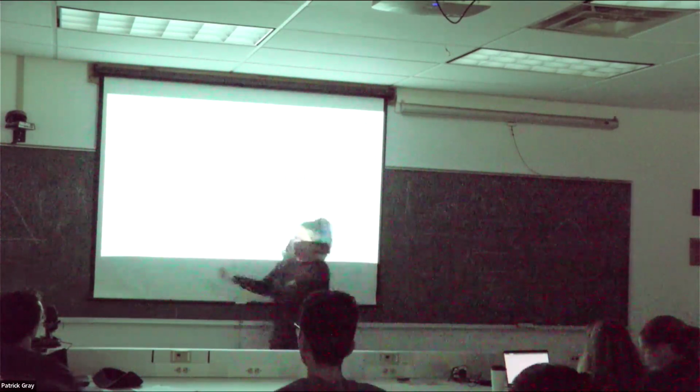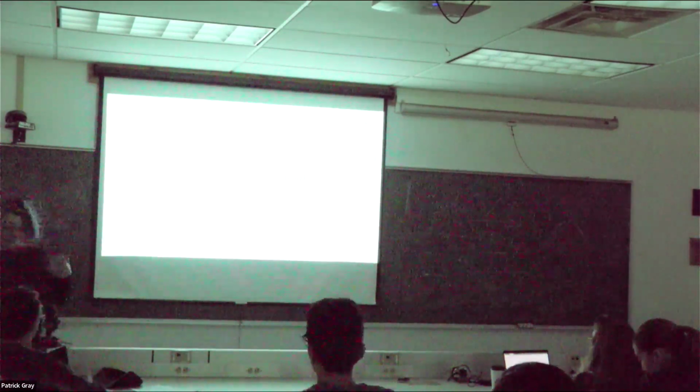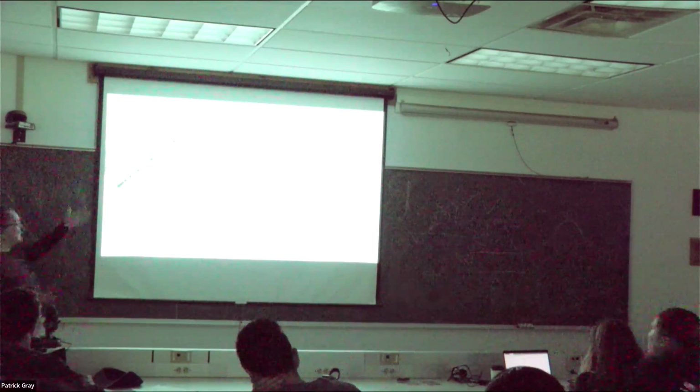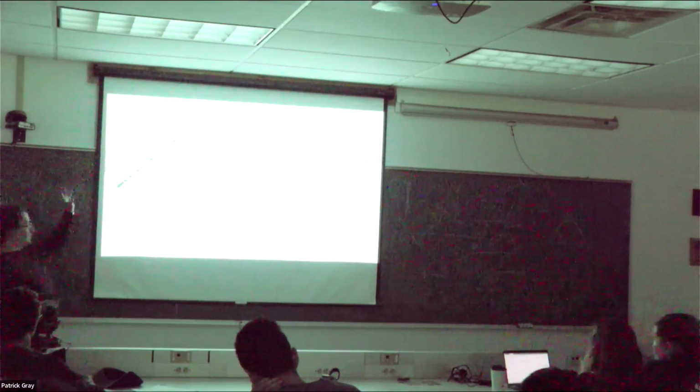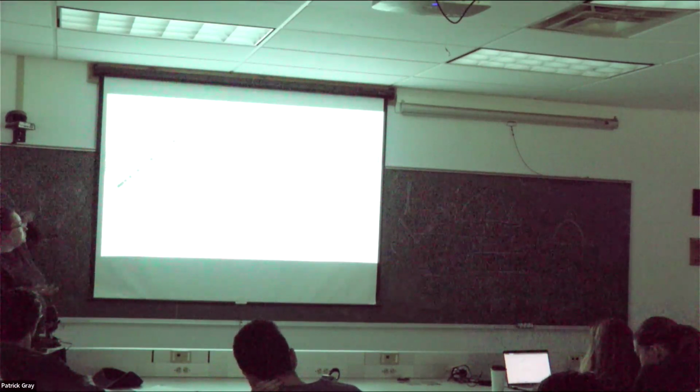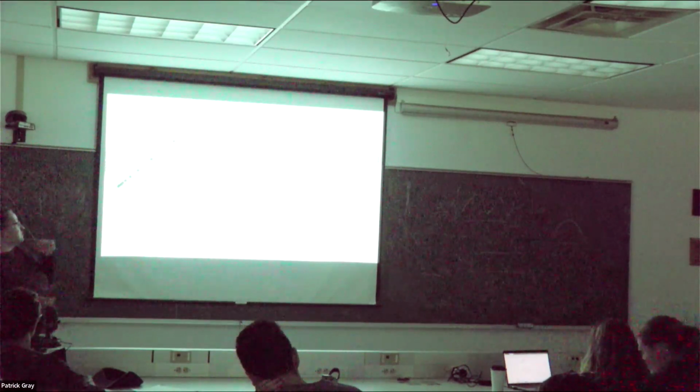So turn around this formula and you make a chlorophyll fluorometer, because that's a very stable relationship, no? You maintain a constant absorption, you have a constant quantum yield because you know what the solvent is. The chlorophyll specific absorption doesn't change because you know how chlorophyll absorbs, and you can derive chlorophyll molecules in solution.